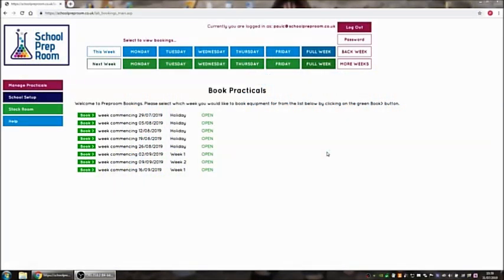Hello and welcome to School Prep Room. Today I'm going to show you how School Prep Room can make setting up and managing hazards around the lab and prep room more simple. We'll look at both the in-house functions as well as the CLEAPSS integration we've been able to include.